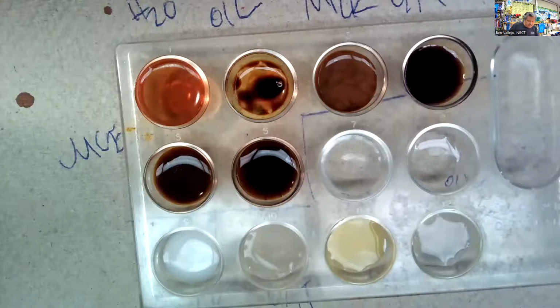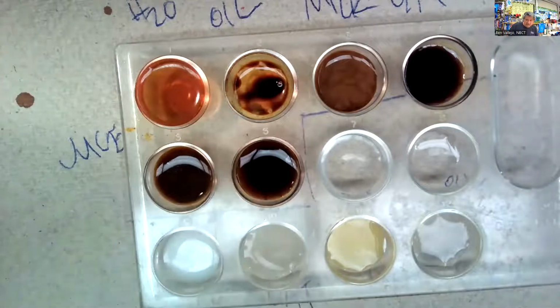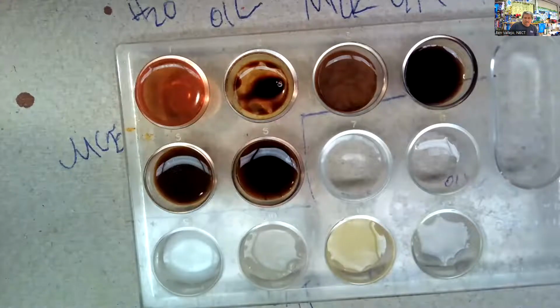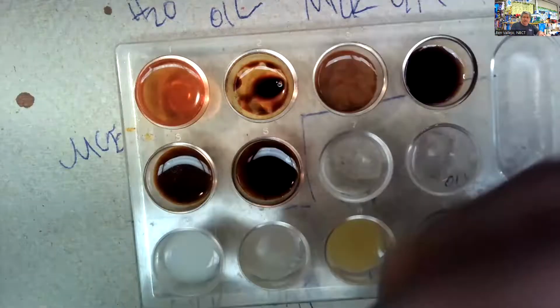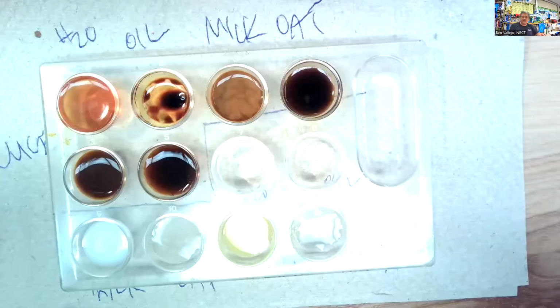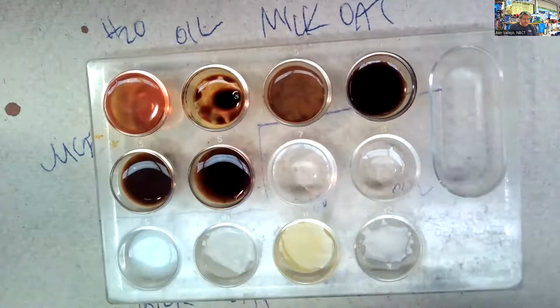It's still not. This is noticeably lighter than this. Okay, so let's test the other one. The other one is a protein test. I'm going to add some biuret reagent to each of these 6 wells.